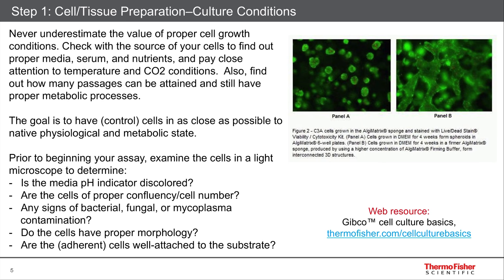Do the cells have proper morphology? Are they shrunken? Do they have weird extended processes? Or are they how they're supposed to look? Are they blebbing? I'll show you an example of that. And are the cells well adhered to the substrate, if you were talking about cultured cells? Or for tissue sections, make sure they're well adhered to the slide. If they're not, they can come off and that can cause artifacts.